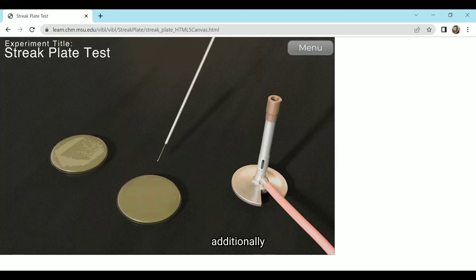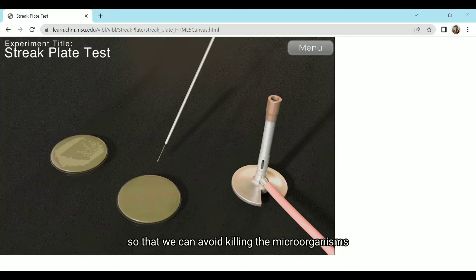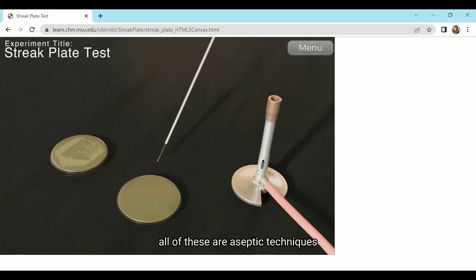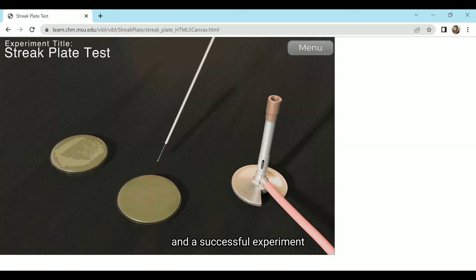Additionally, we must allow the loop to cool a few seconds before contacting the inoculum so that we can avoid killing the microorganisms we are going to isolate. All of these are aseptic techniques that we follow to ensure an isolated colony and a successful experiment.